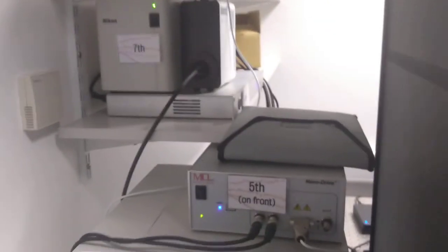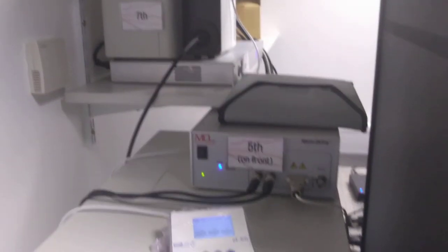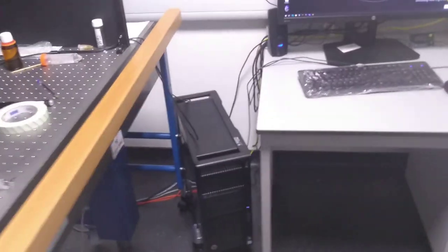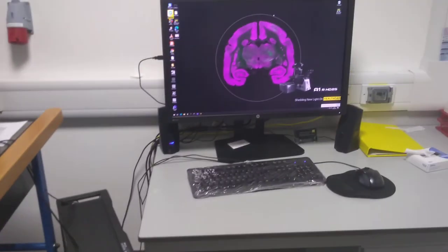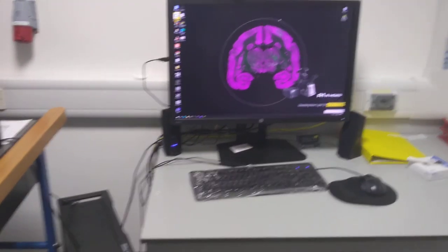Once these components are all on, you can then turn on the computer if it is not already on. Thank you.